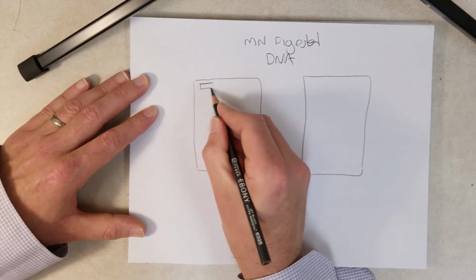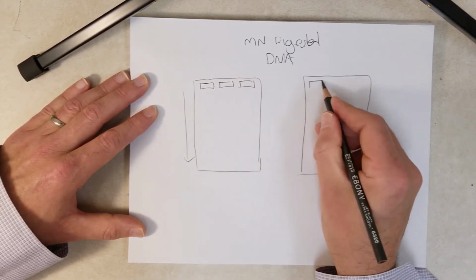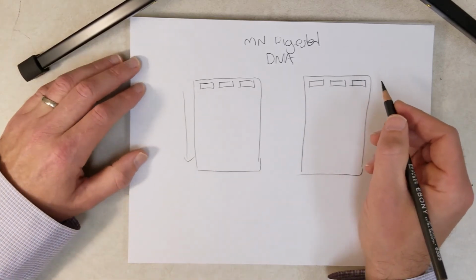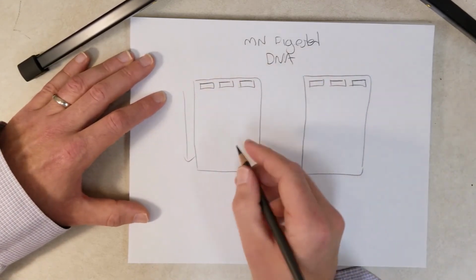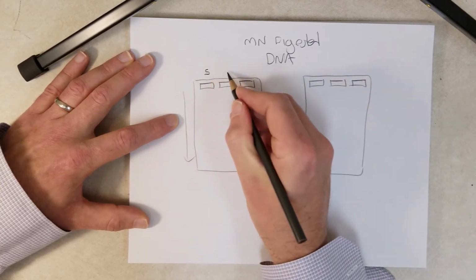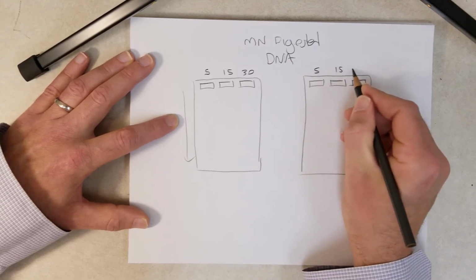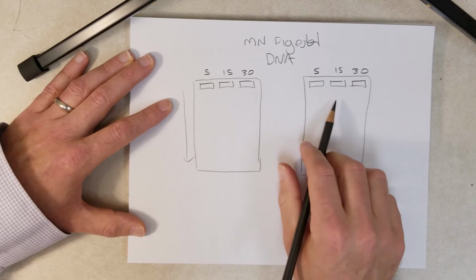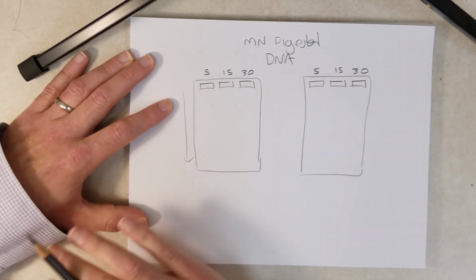Here are the lanes up top, so the DNA is going to migrate down this way, with smaller, shorter molecules migrating faster than longer molecules. Here we separate the DNA. This will be 5 minutes, 15 minutes, 30 minutes, and the other half of the samples will be over here. When we run the DNA in both gels, we're not going to stain it with ethidium bromide because we don't want to see all of the DNA.